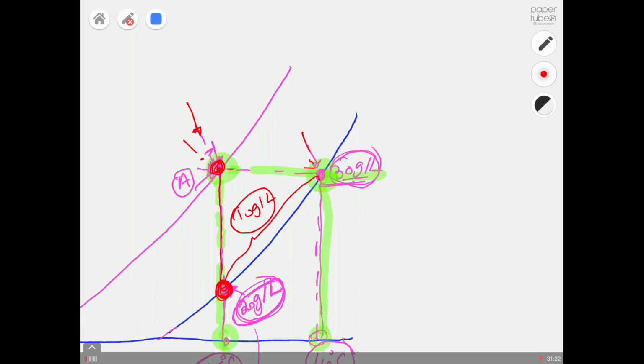So what they want is to identify some process conditions where they can grow crystals, but without the formation of any nucleation. So they don't like nucleation in many experiments. So they need some conditions. So how to identify those process conditions? I will show you quickly now.